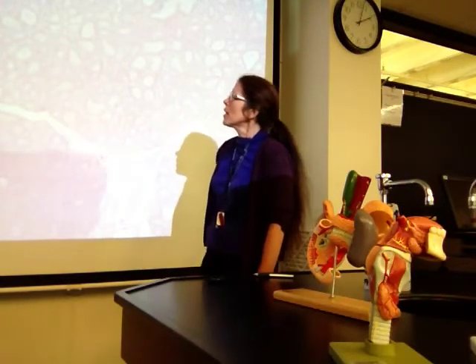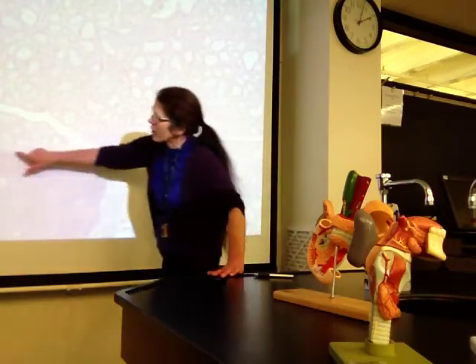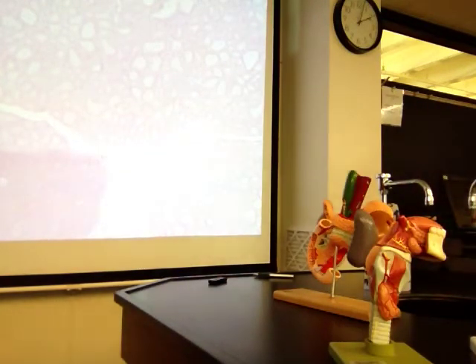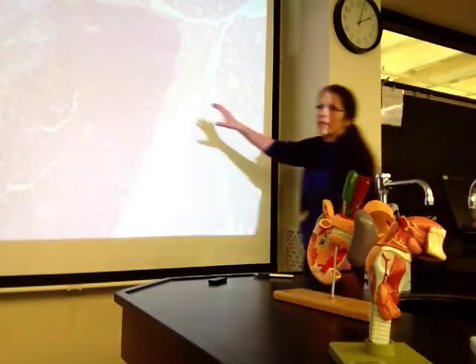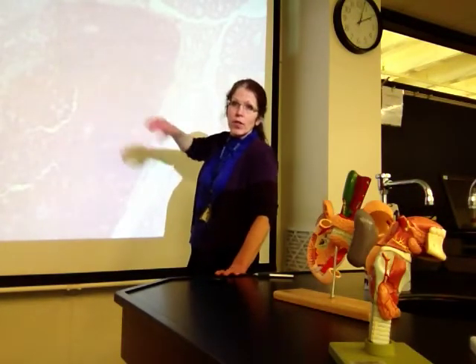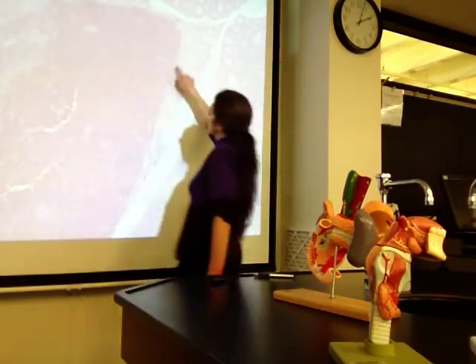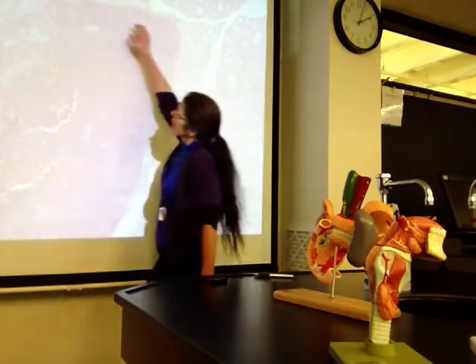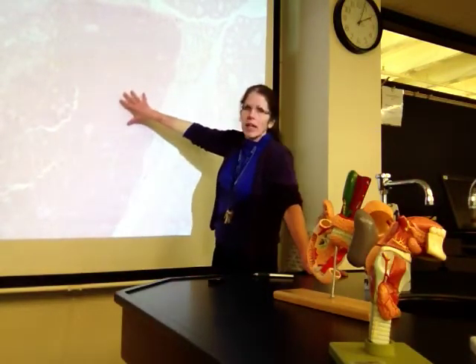Now something else that you see on this is a structure here, which is a lot denser. You can see the contrast between these two things. Let me move the slide just a little bit to get more of that structure there. Yeah. So suddenly now I've got a whole lot of this in the middle, and most of what you're seeing on the screen is this structure with its boundary right about here. This is actually called the parathyroid. It is a separate gland, so a separate organ structure. It is encapsulated, there's a thin line to show you this, by some connective tissue. And this is called, again, the parathyroid.